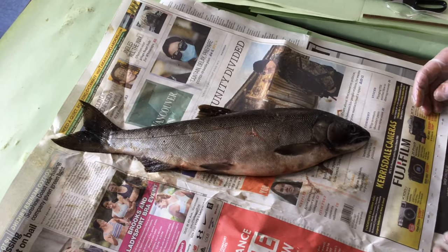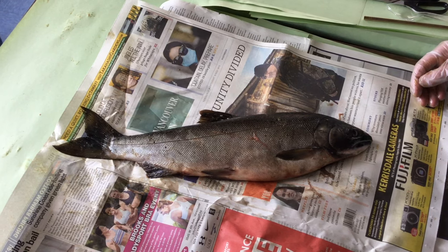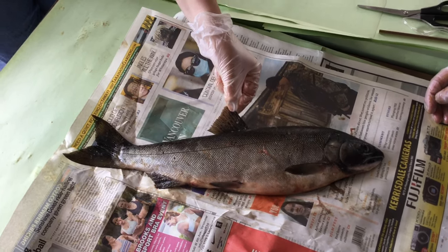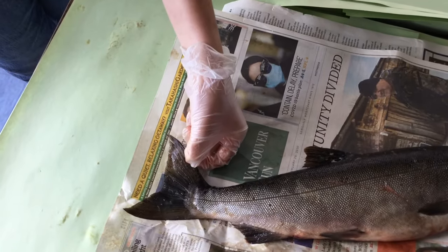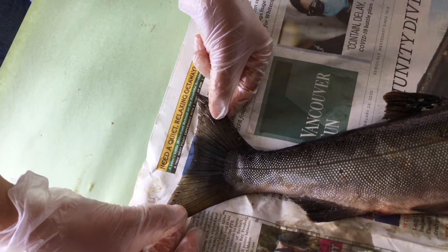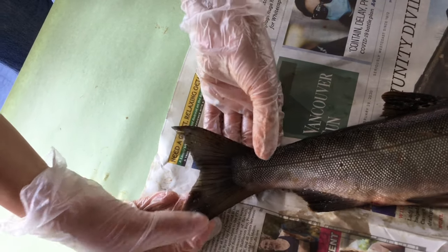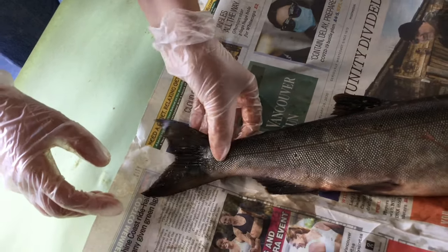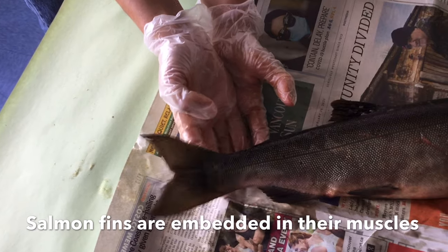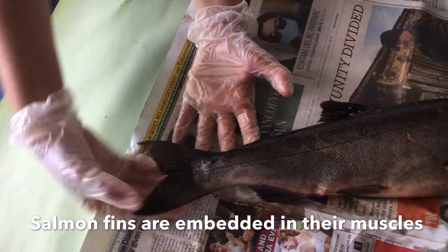All right, so now that you've drawn the fins on your salmon, we are going to take a look up close at one fin. There, a still will be attached, so you can look very carefully at the tail fin. You will notice that it has a fan of bone-like spines with thin skin stretched between each of the spines. If we compare this to our limbs, which are linked to our bones, are the salmon's fins attached to bones in the salmon? No. Salmon fins are actually embedded in their muscles, and this makes them very flexible as they move in the water. Now, draw that fin up close.